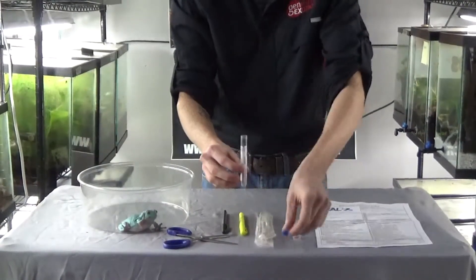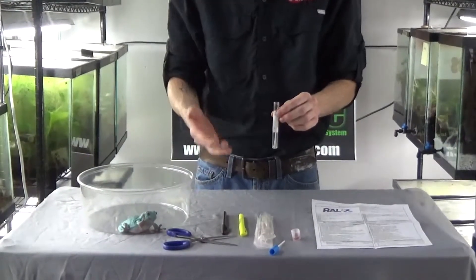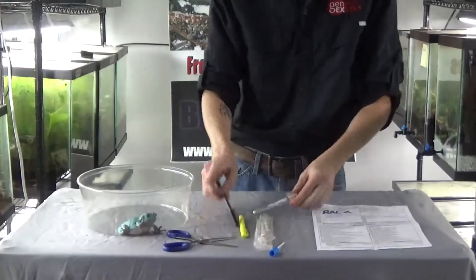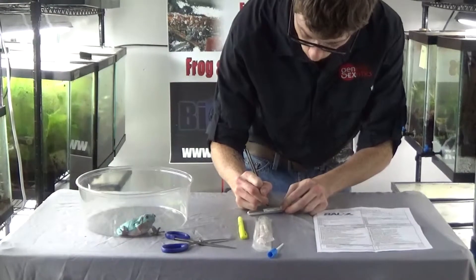This helps keep the inside of the tube as clean and sterile as possible. Now, the scissors are not sterile, but we do the best that we can. Put on the lid and label it with whatever species and name — so this one will be labeled dumpy, female, number one.